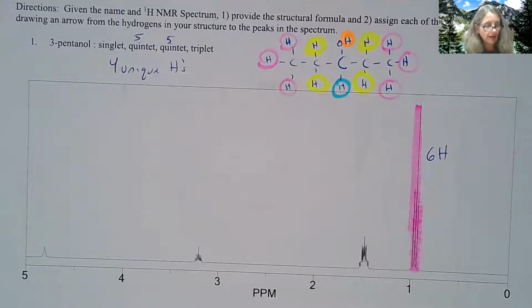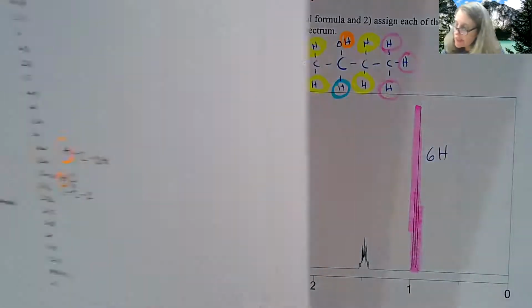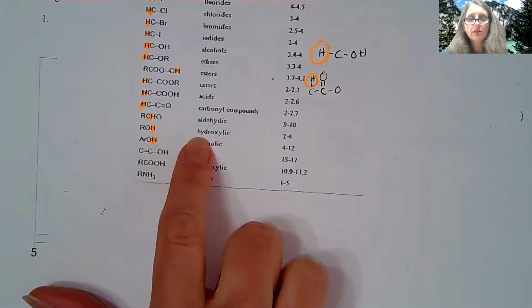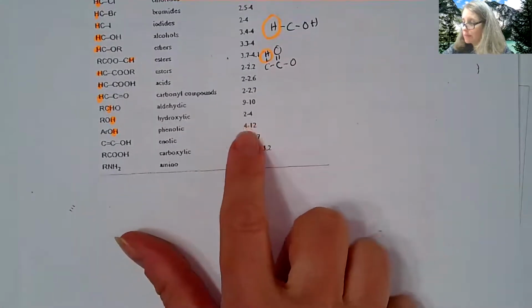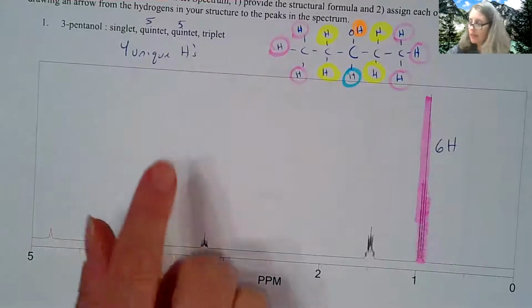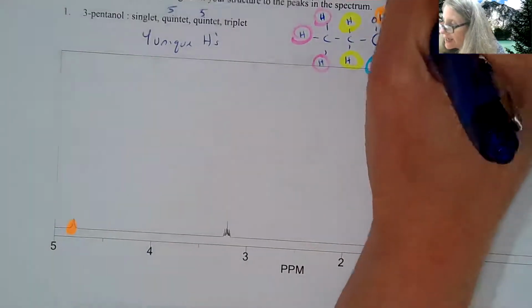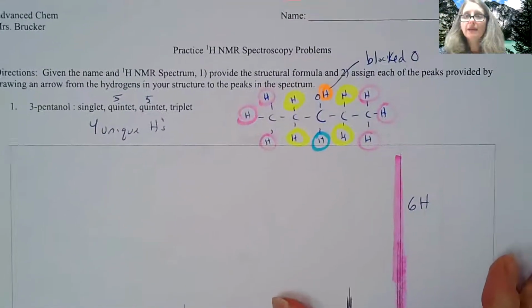All right, then I can look at the hydrogen that's on the O, which is what we call the alcohol. So down here on your list, ROH, the hydroxylic hydrogen. This is the one that's going to give you the most problem on the NMRs because it says here between 2 and 4, but you will see that this peak down here is a singlet, okay? And what happens is that hydrogen is blocked by the oxygen. So write down blocked by the oxygen.